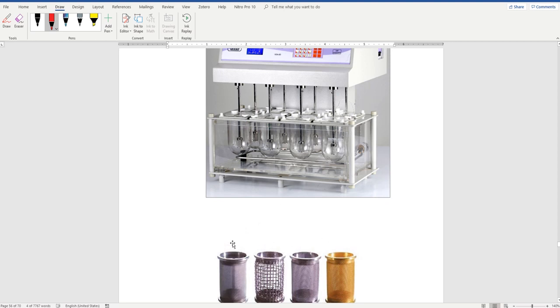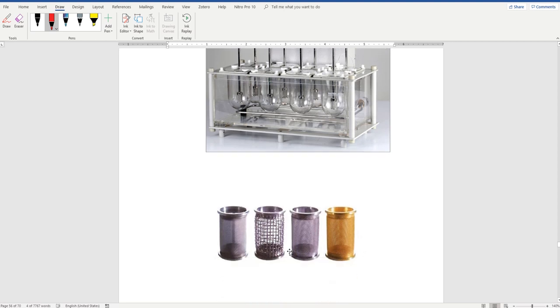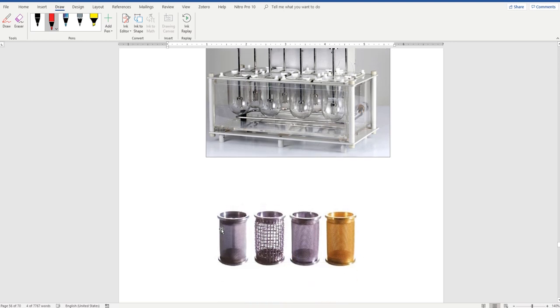For each one we will add. طبعا we are not using all these. There is only one of them we use. One kind يعني we use depending on the pharmacopoeial specification. Okay? The drug should not interact with the material of the basket. طيب.